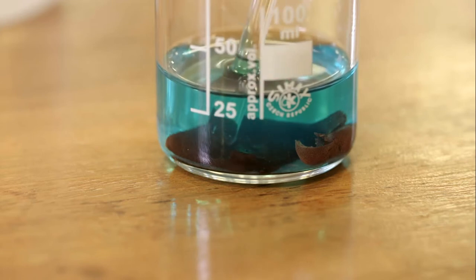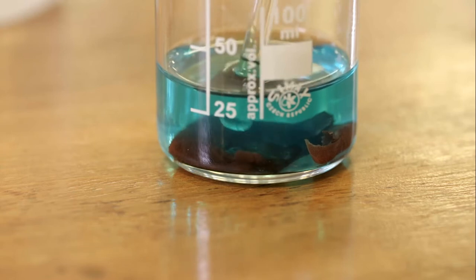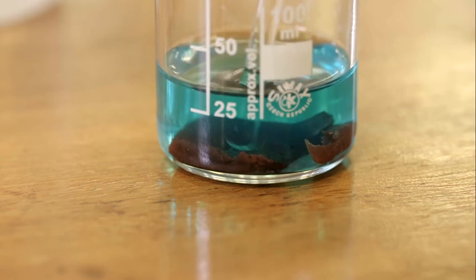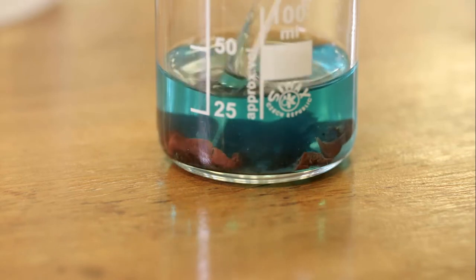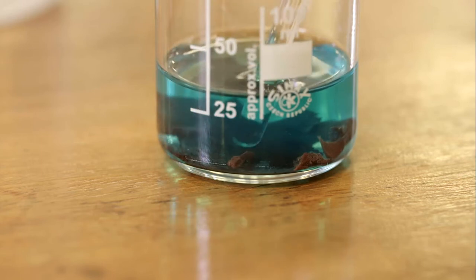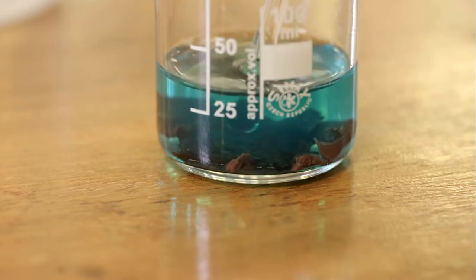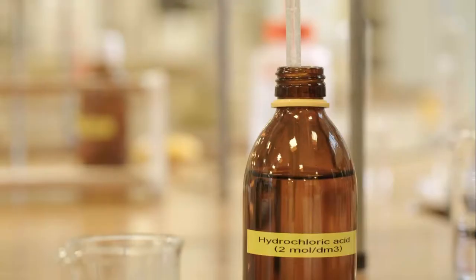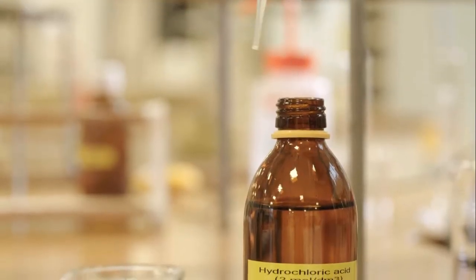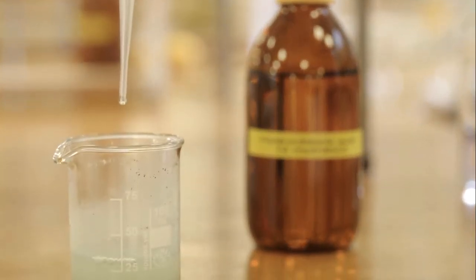In order to remove any copper produced, the zinc should be scraped with the glass rod. The reaction has stopped when no more copper forms on the zinc. Once the reaction has stopped, 5 to 10 drops of hydrochloric acid are added to the beaker.